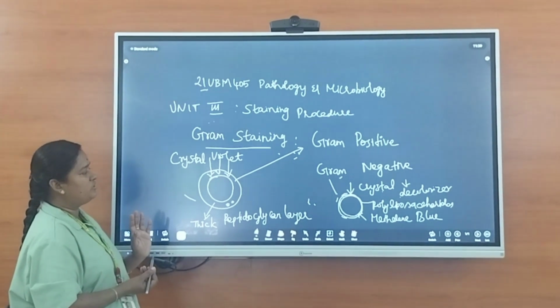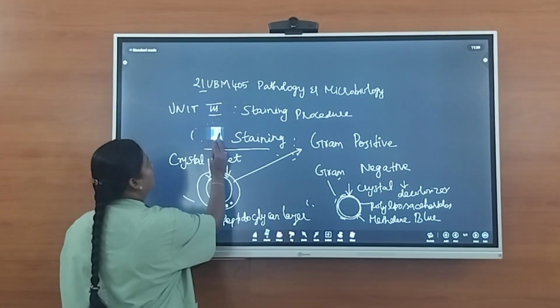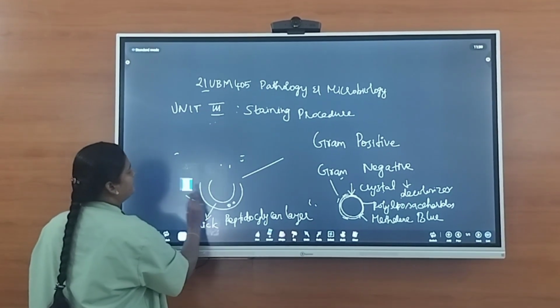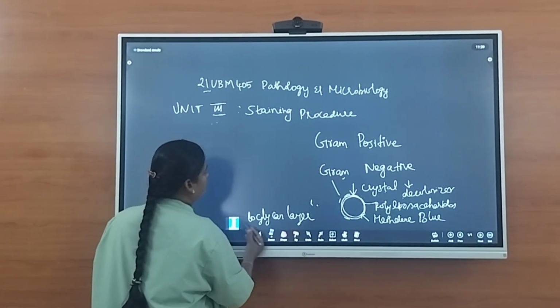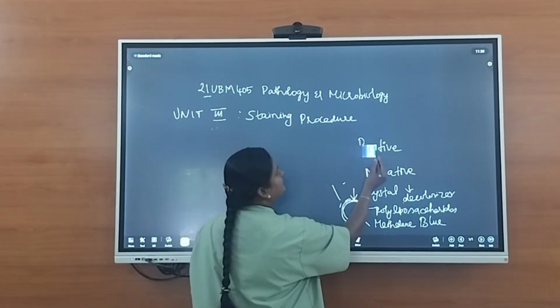What procedure should we follow? We will see now how we are going to do this gram staining. There are step-by-step procedures to be followed for gram staining. We will see now how we are going to do the process.